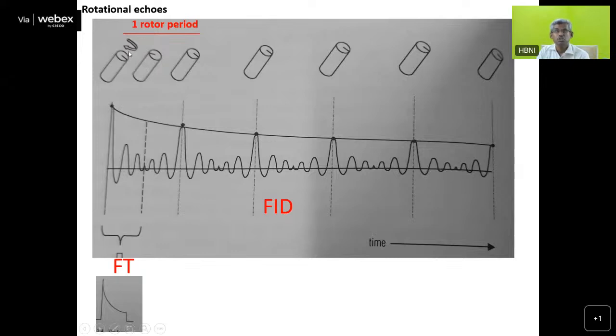Correct. So first you start from here and then you rotate half a circle, and then you complete the rotation. So you will see a range of field, and this range of field is like a disturbance. So it will have a range of magnetic field felt. So it will have this type of response, and then finally it will come back to this type of response again. So this is nothing but the FID. So FID normally it will be like this.